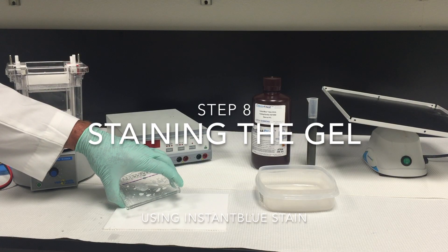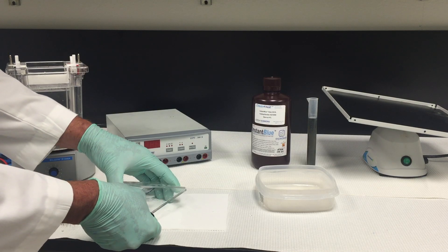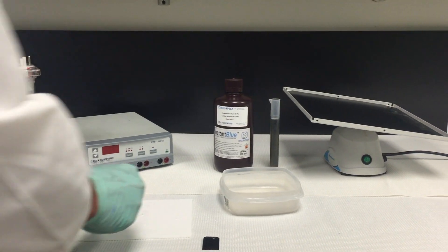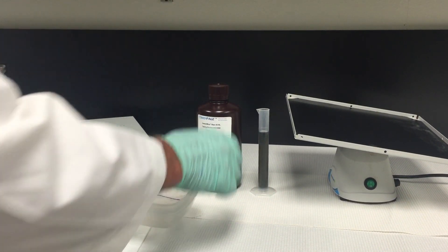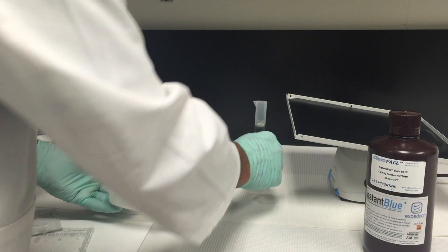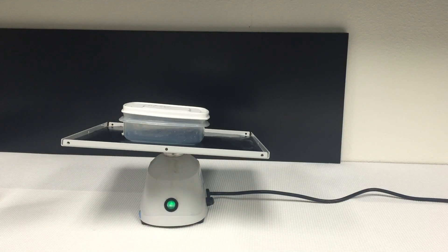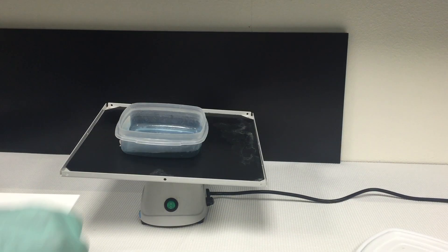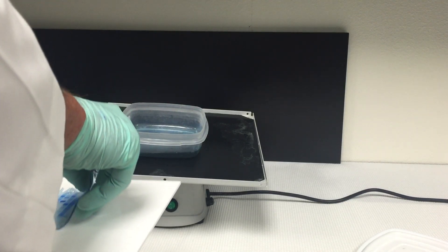Step 8: staining the gel using Instant Blue Stain. Open the gel cassette using the wedge plate separator. Place the gel in a small container. Gently invert the Instant Blue Stain bottle a few times to mix. Use about 25 ml of stain per ClearPage gel. Put on a rocker and stain for 10 to 30 minutes. No de-staining is necessary. After staining has finished, remove the gel and rinse with water.